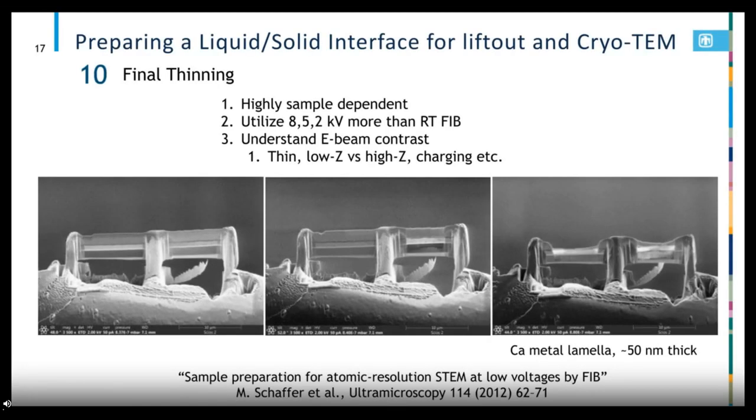So then the last step is final thinning. This is highly sample dependent. I've shown 3 images kind of progress through one of my thinning procedures. And you can see the contrast of each layer changes throughout the process.